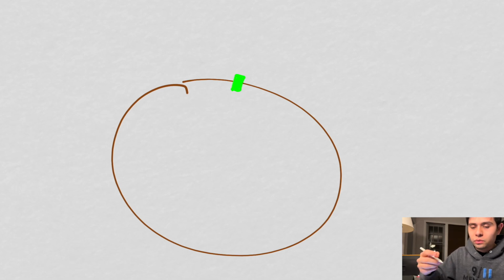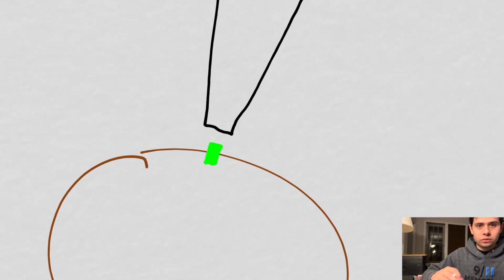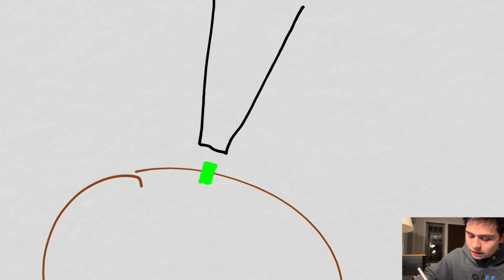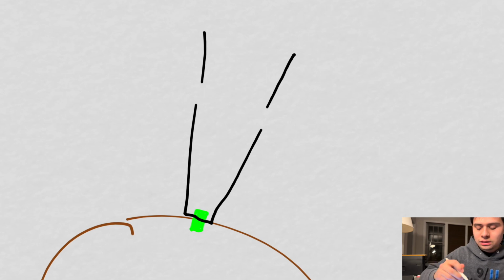So this is our glutamate receptor, and what you do, this is very interesting. You take a very fine needle. This is really not to scale, I'm blowing this up way zoomed up, if you will. You take a really, really fine needle and you move that needle so that it comes in contact with the cell. And what this does is it selects a small patch on the membrane of the cell.